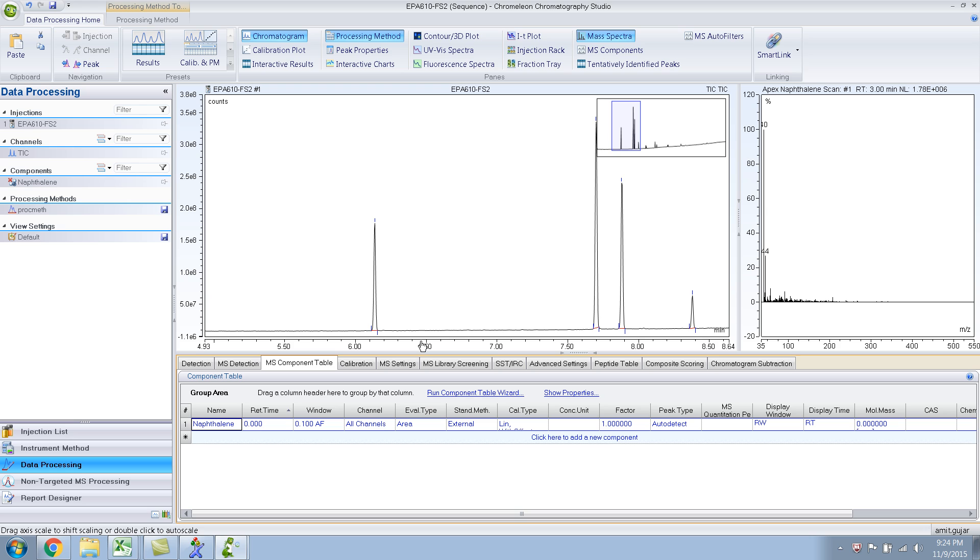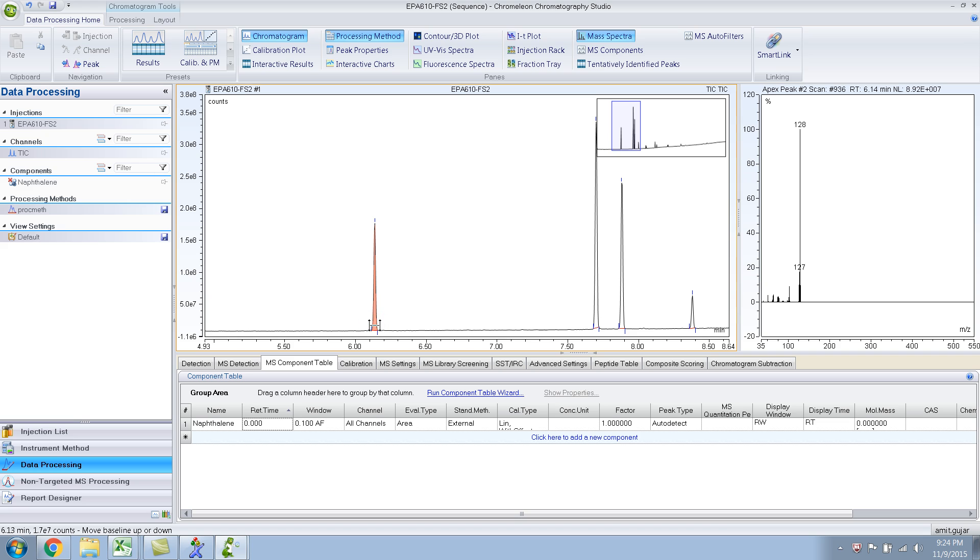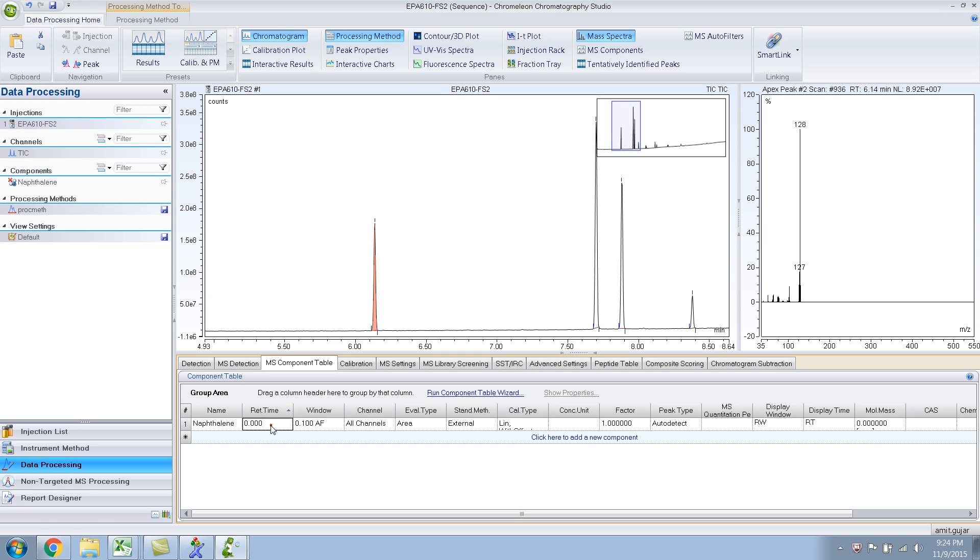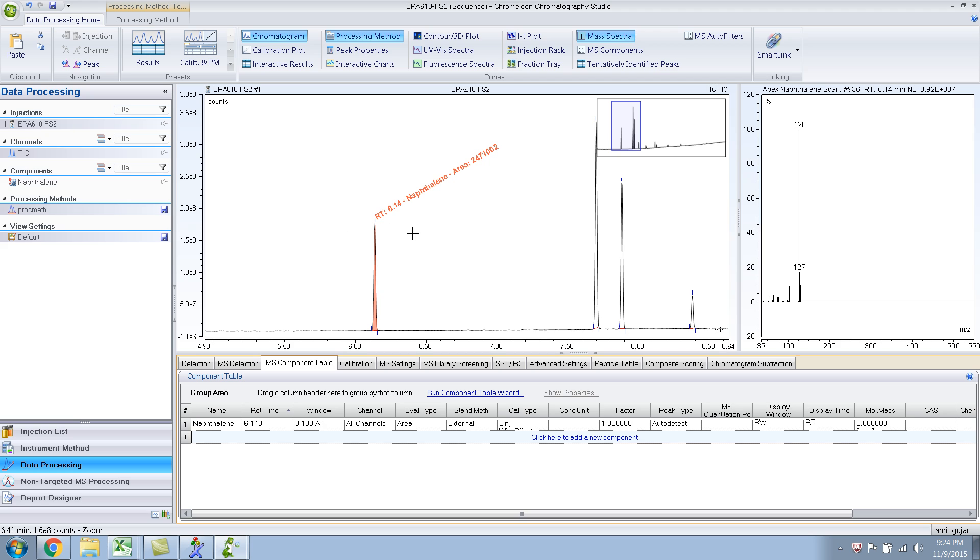So it automatically creates the compound naphthalene, but as you can see the retention time with respect is zero. So you need to type in the right retention time for this compound. So let me click on this compound again. You can see it over here, RT 6.14. So that's what you type in, 6.14. And enter, and there you go. So you have your first compound in the component table.